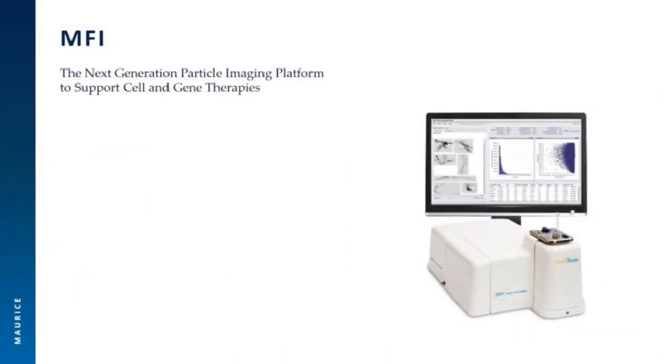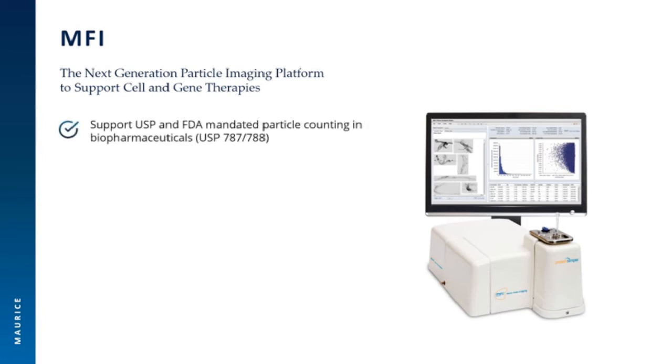Moving to our last analytical instrument of the day, MFI is the next generation particle imaging platform to support cell and gene therapies. MFI can support the USP and FDA mandated particle counting for biopharmaceuticals, namely the USP 787 and 788, and is used commonly for counting biopharma product aggregates.